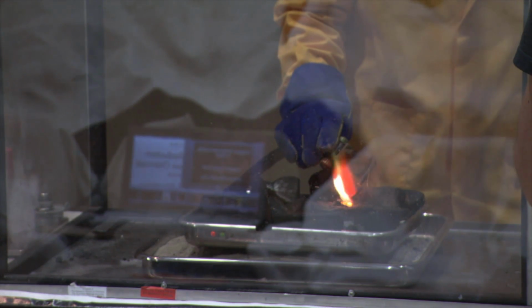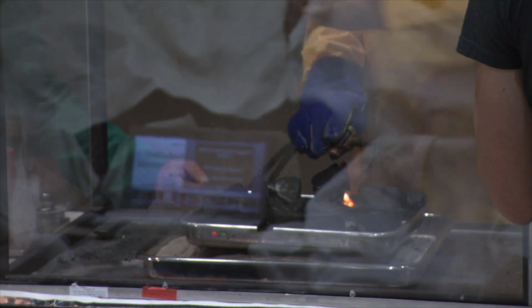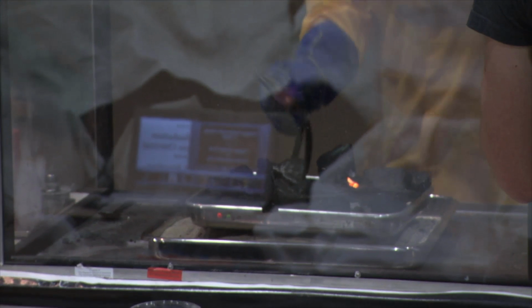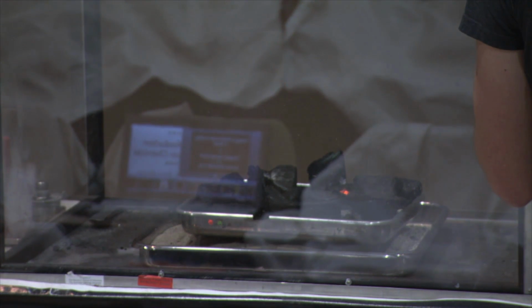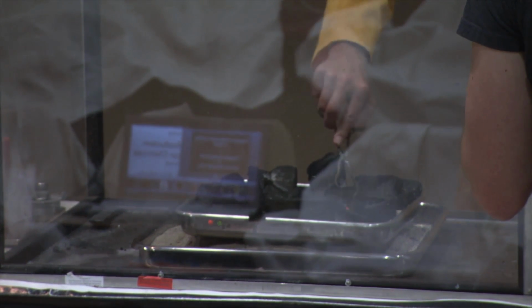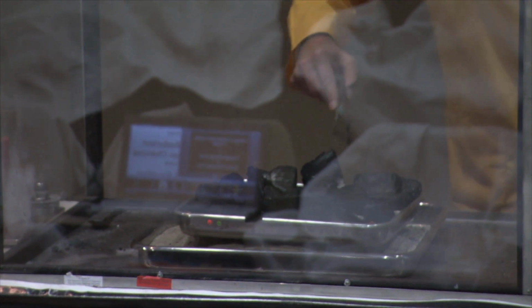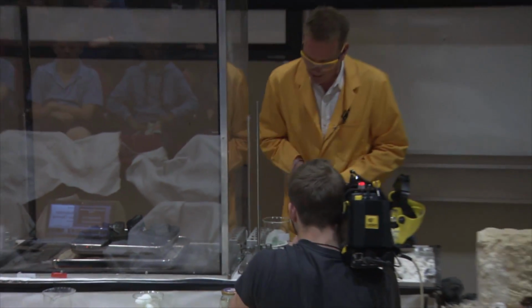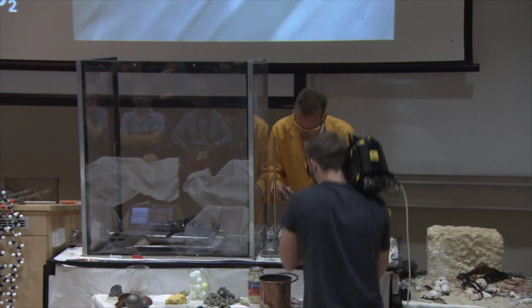Right, now I'm going to fish this out and put it into a little bit of acid in a minute. I just need my tongs over here. That's good. Thank you. So at the moment this is still hot, and of course it may react with some of the oxygen from the air. So I'm just going to put it into some sulfuric acid, and that will dissolve away any of the remaining copper oxide. Oops, there it is. Where's it gone? And that will get rid of any copper carbonate, if there is any left. So this is the piece that I've just added.